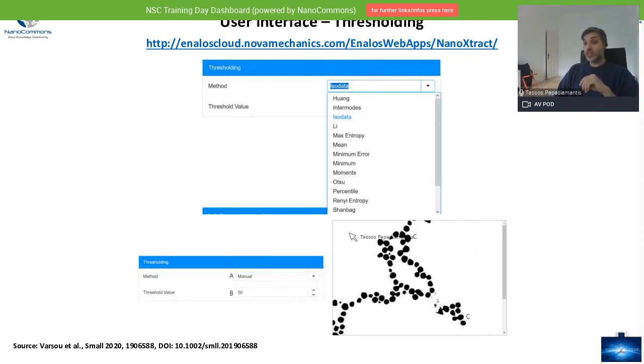So what we do here, as I already said in the overview, is apply a threshold algorithm. We divide the image into two: above the threshold, we turn everything into white, and below the threshold, we turn everything into black, and then we invert the image. The result here should be something like this, a very white background with very black nanomaterials.